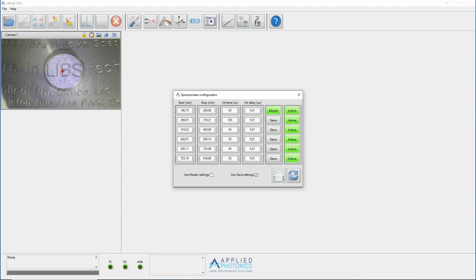The parameter values currently displayed in this configuration window will be saved to the libsoft configuration file when the application is shut down and automatically reloaded the next time the application is started.